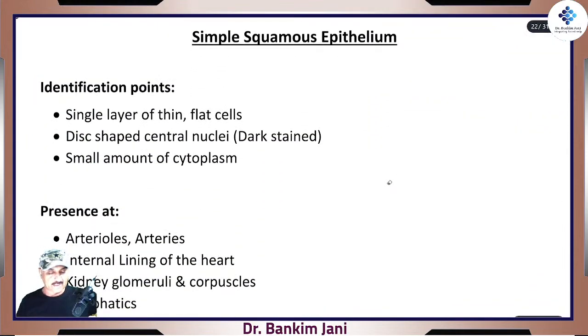So this was in summary simple squamous epithelium. I'll upload all these files for you, and I have hundreds of such images. The advantage is that it would be the same slide.